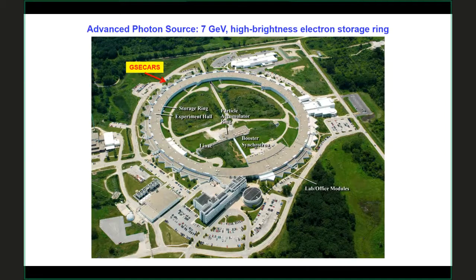About half of these beam lines are run by the APS themselves, and the other half are run by outside groups, and we are one of those outside groups. We're nearby, we're from the University of Chicago, but the University of Chicago actually runs 7 of the beam lines at the APS. And I'm particularly associated with a set of beam lines called GSECARS, which stands for Geosoil Enviro Center for Advanced Radiation Sources. And that's sector 13 at the APS. And that's where I am right now.